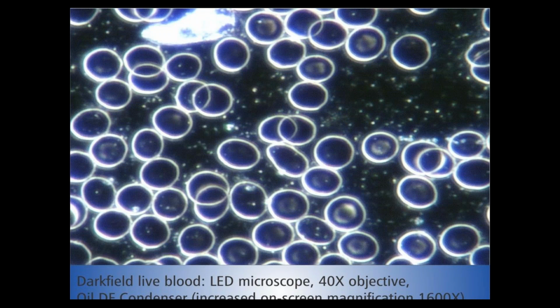I see. So again, it's a lot to do with not just the blood cells, but actually what's happening in the background as well, yes? Absolutely. That's actually the reason why we use dark field. Most of the cells and the red cells and so on, you can see quite clearly with bright field. But with dark field, we really want to be able to see the smaller, finer structures between the cells in the plasma and also inside of the cells. So the dark field allows you to actually see in the cell, whereas with bright field, you are not able to do that at all.